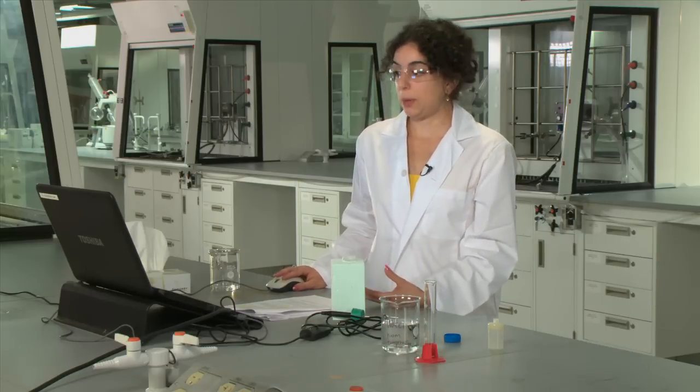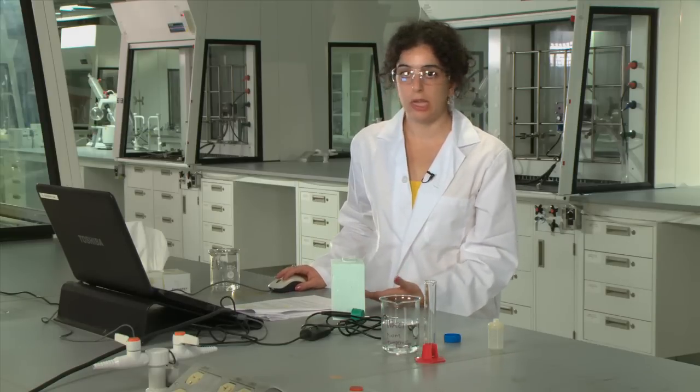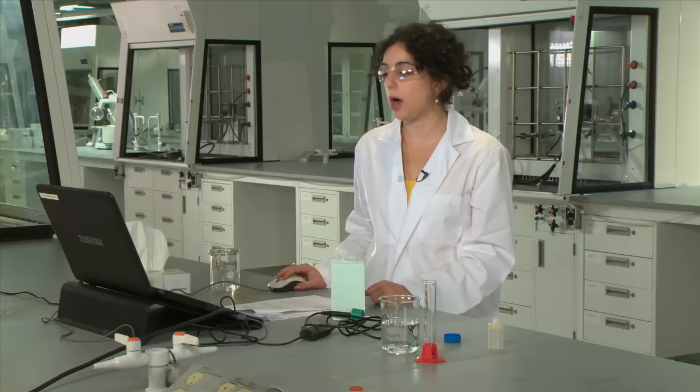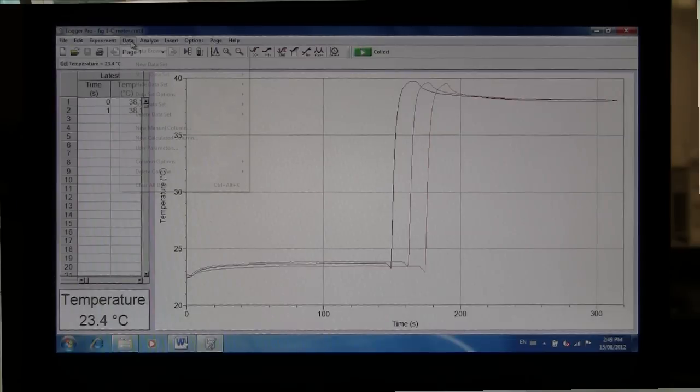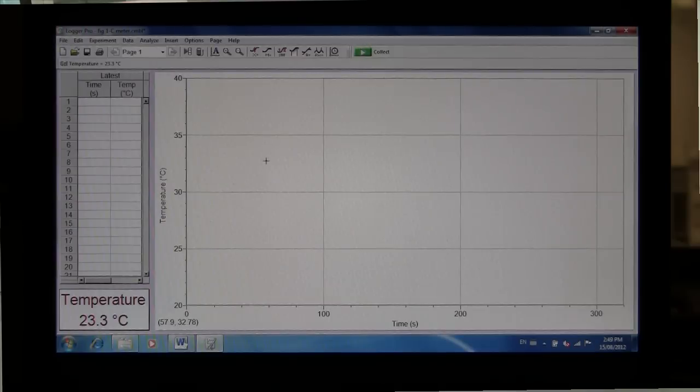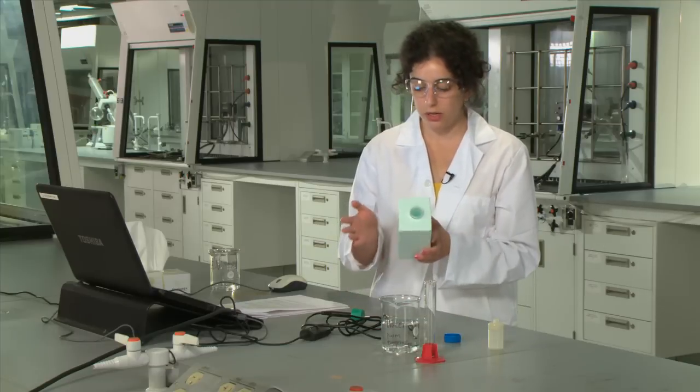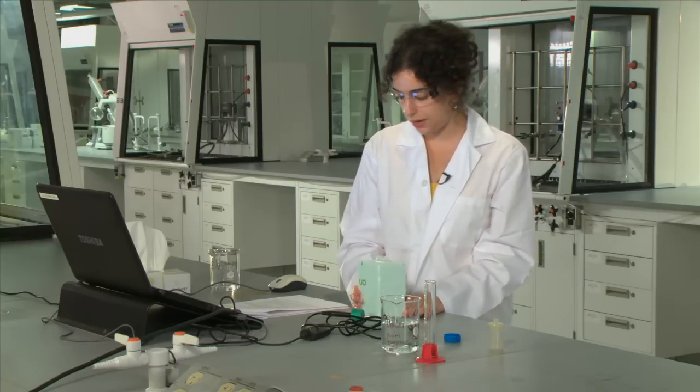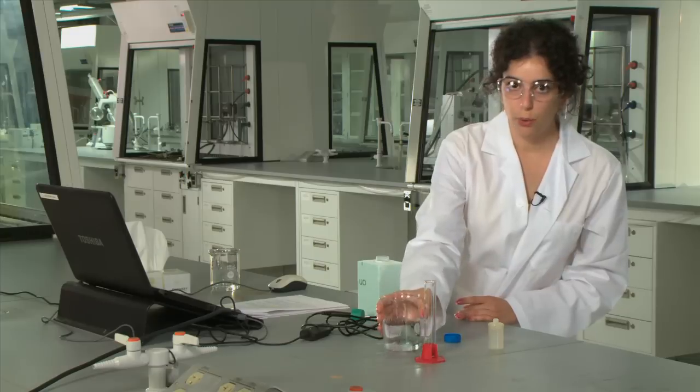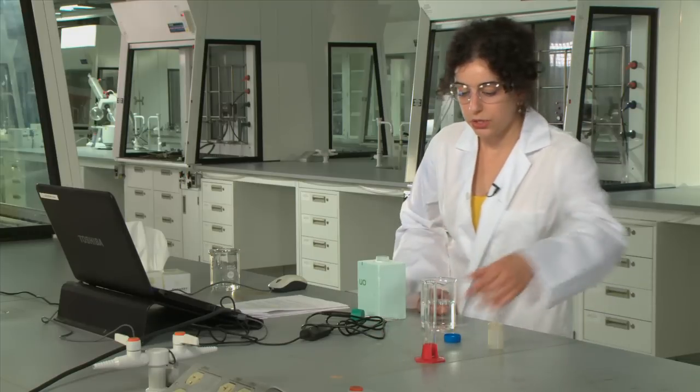For the next part of the experiment we're going to still use the same collection method that we used for the first part but we're going to remove these traces. To do that we're going to go to data and then select clear all data and now our graph is ready to go again for the second part of the experiment. So now we have our cleaned out calorimeter and we're going to add 35 mils of our room temperature water to the calorimeter.